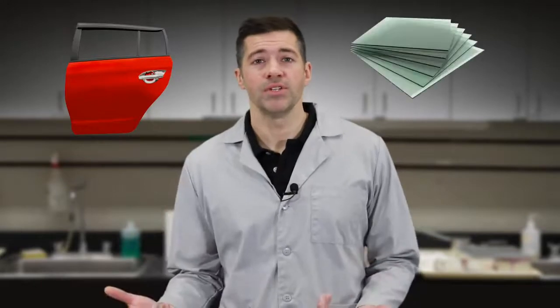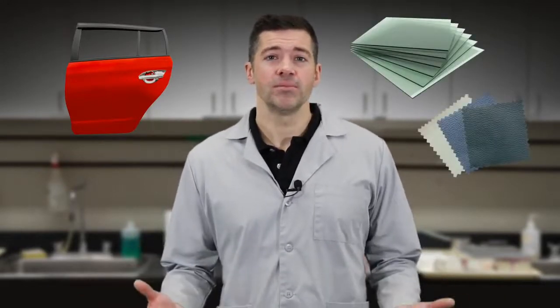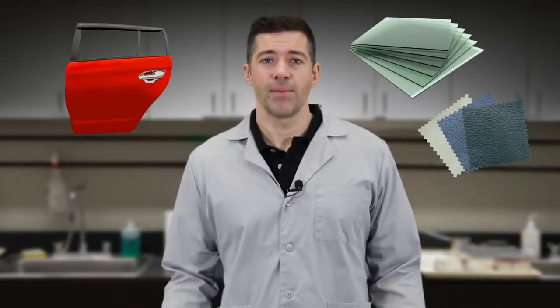Now to make things slightly more complex, if all samples were flat, opaque, or the same thickness, one instrument would work for all industries. However, in reality, other types of materials must be measured, such as curved surfaces, transparent objects, and textured objects. For this reason, different instrument geometries exist. Let's take a look at the three most common types to wrap things up.